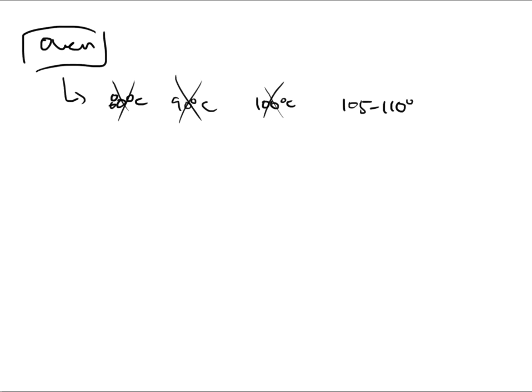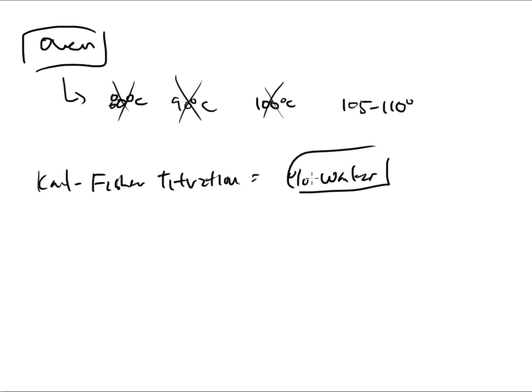The other thing I would like to say is that there is something in a laboratory called a Karl Fischer titration. And a Karl Fischer titration measures the percentage of water. Now, keep in mind, this is strictly water. So this makes this method a little bit better. I mean, if you're doing loss of drying and you really do want water only, and you don't want to worry about any low evaporative volatile solvent, then a Karl Fischer titration will kind of provide you the same number. But this is specific to the percent of water only.